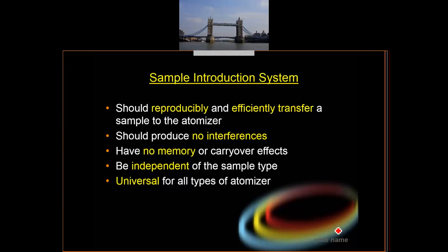Okay, if we suck in something that contains sodium, the plastic material that is being used to suck the sodium should not interact with the sodium. It should not be sodium plastic afterwards. Okay, can you understand? It sucks water that has salt, and what arrives at the atomizer is water that has salt. The suction material is made of plastic. What arrives at the atomizer should not be salt that contains plastic. That is what it means. There should be no interference.